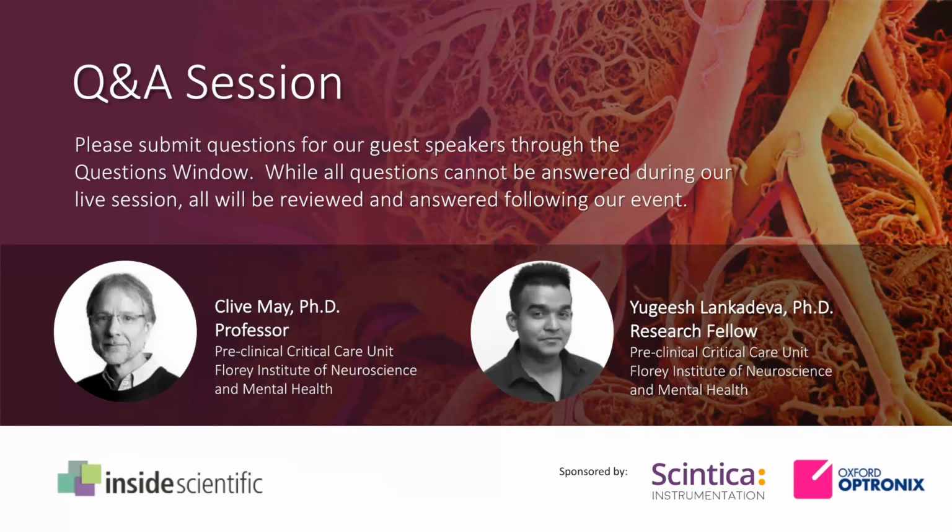Okay, thank you. Michael, this next question is directed to you. Is it possible to use this method, or can it be altered to measure cerebral perfusion during resuscitation? The short answer to that is absolutely yes. Our monitors and sensors have been used quite extensively in a variety of animal models to make cerebral measurements in a variety of situations. Obviously, there's the question of access, and sensors need to be placed via craniotomy.